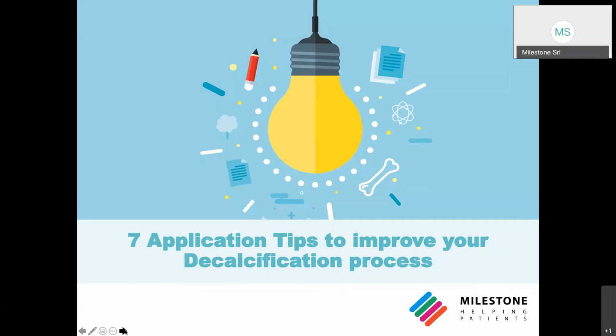Today we are here for our live webinar titled 7 Application Tips to Improve Your Decalcification Process. During this live webinar, we will discover the best practices of decalcification and how you can enhance this technique.